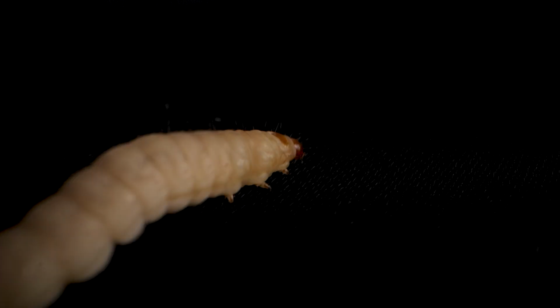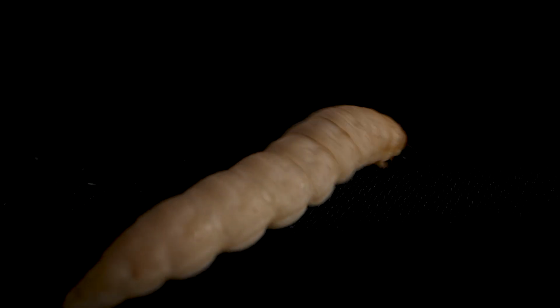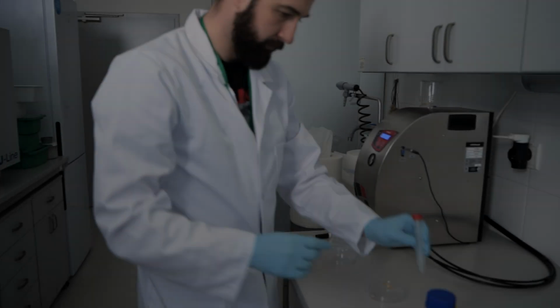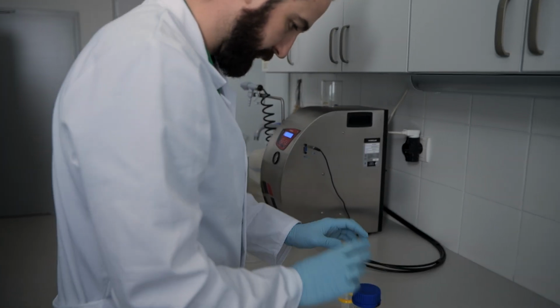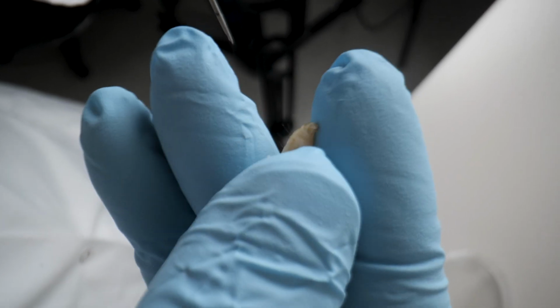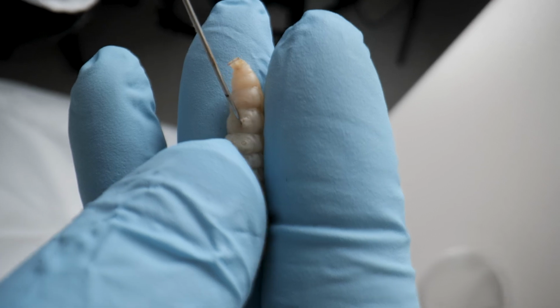A larva is a distinct juvenile form that many animals go through before metamorphosing into their next life stage. It moves instinctively, searching for food while avoiding light. These simple and seemingly predictable behaviors are actually very useful to scientists, as they allow researchers to track changes in its routine when exposed to microdoses of various chemical substances.